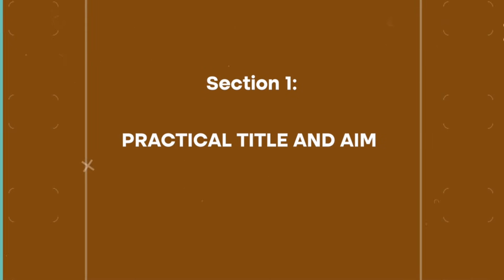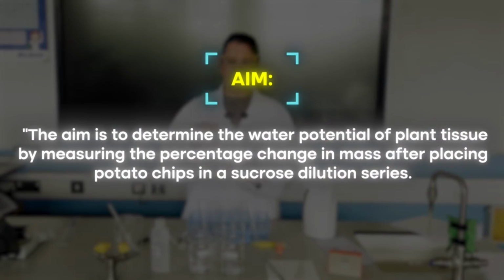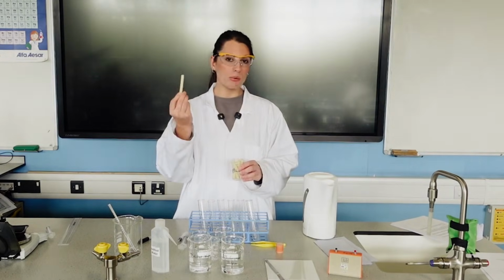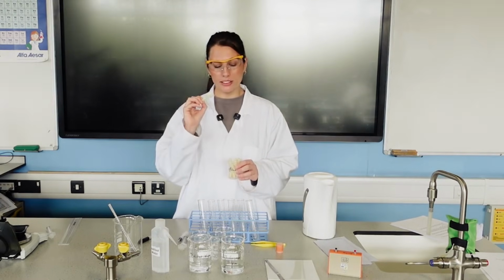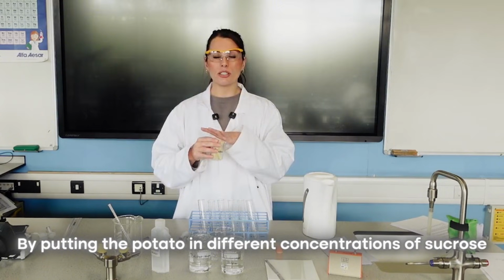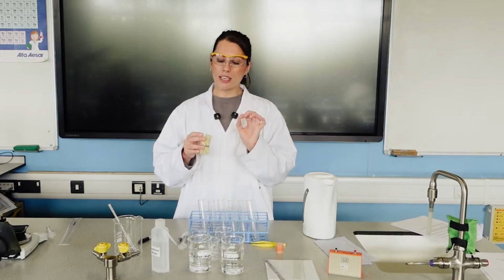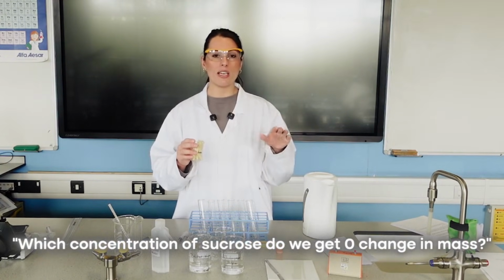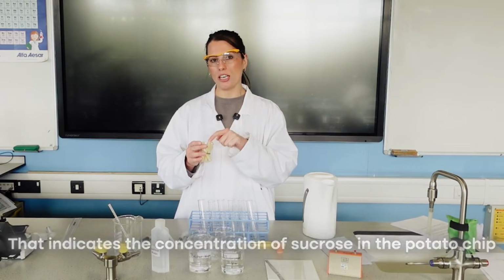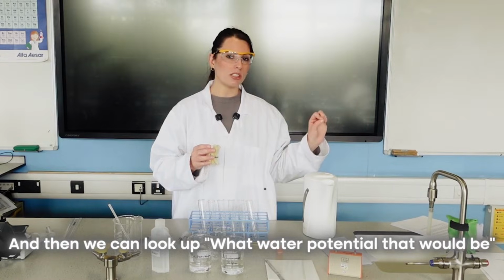So the aim of this required practical for students is they need to work out what is the water potential inside of a piece of plant tissue, and also learn how to do a dilution series. And they're going to be working out the water potential inside of the plant tissue, or in this case, the potato, by putting the potato in different concentrations of sucrose. So we can then work out at which concentration of sucrose do we get 0 change in mass. That indicates the concentration of sucrose in the potato chip. And then we can look up what water potential that would be.